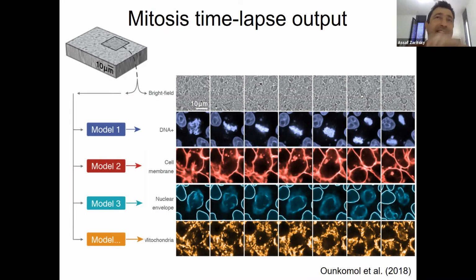And then you do it on a lot of data, and you say, okay, if what I care about is the timing of division, I want to detect the divisions, I can use this in silico. In silico is in the computer, right? They call it in silico labeling or synthetic cell. So you can develop now a quantitative measure, prove that it's good for this application and use it, right? People don't do it yet exactly, but next week we'll hear a little more about that.